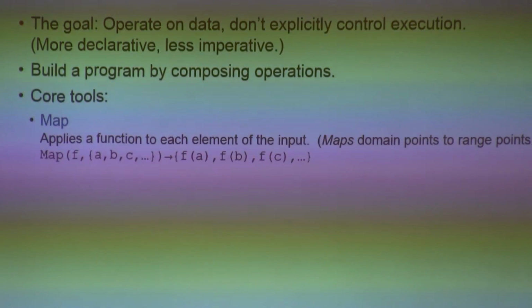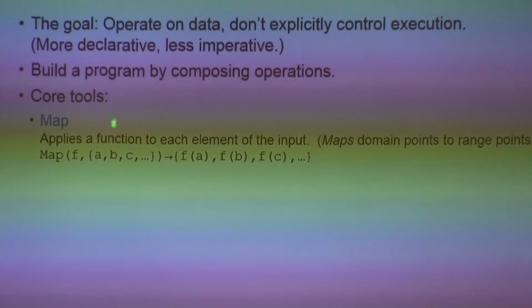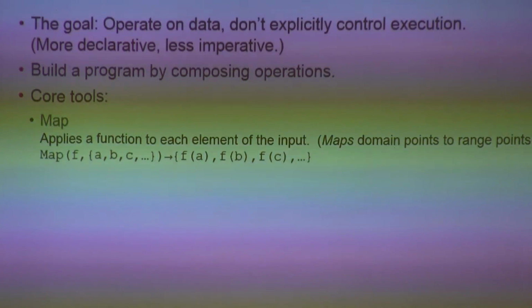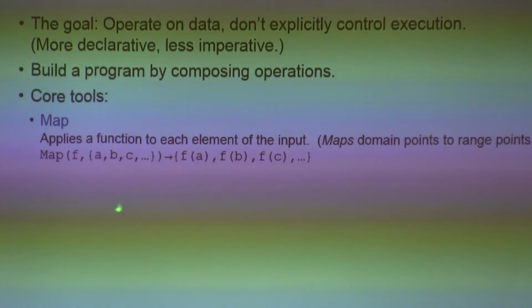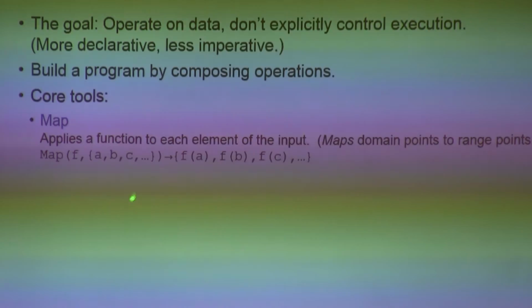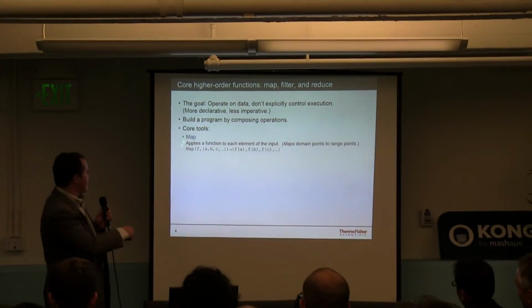Core tools in this is very elementary for probably 3/4 of the audience. You have to have a map function, which is going to apply a function that you provide to each element of the input. And in the instrument control context, this map can include some of these instrument commands in addition to some computation. So we not only say, oh, well, we take it to the third power divided by 4, or give me the length of a string.